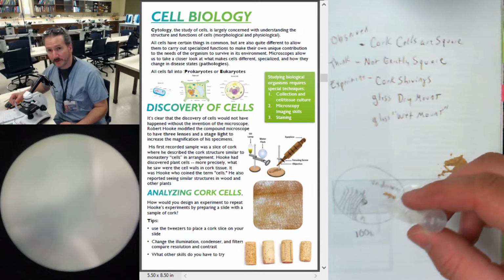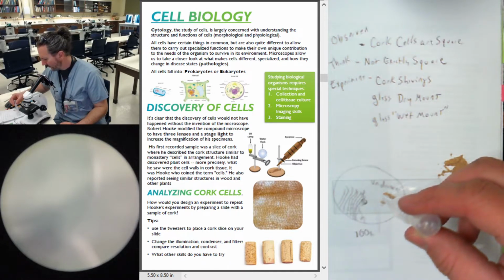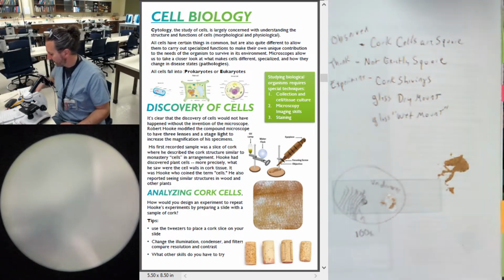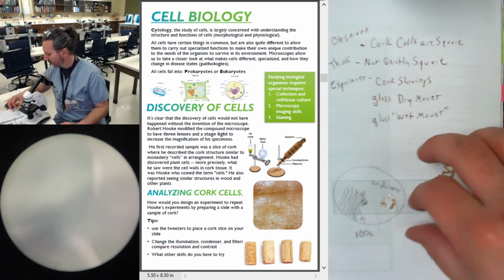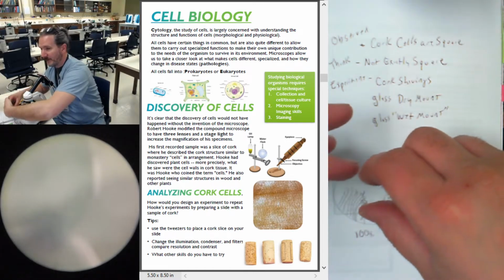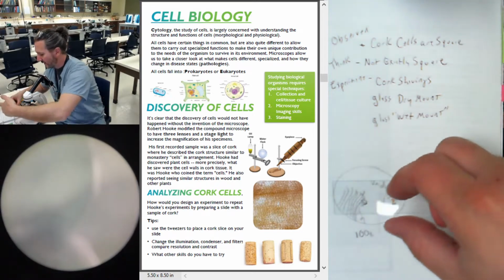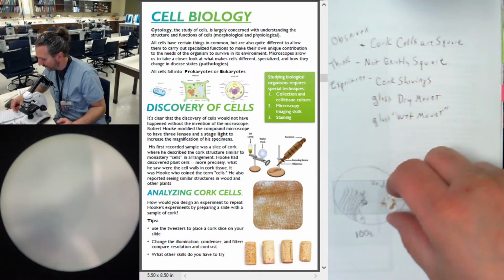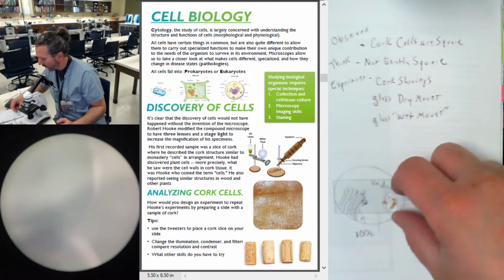I'm just going to hover. Boop. Ooh, man. I probably should have stopped at 1. I'm going to stop at 1. Slide cover slip, sorry. I'm going to take this, I don't know how well you can see it, but here's the edge. I'm going to tilt it at 45 degrees, touch the glass, and I'm just going to drag it back until it hits the water, let it drop. Boom.